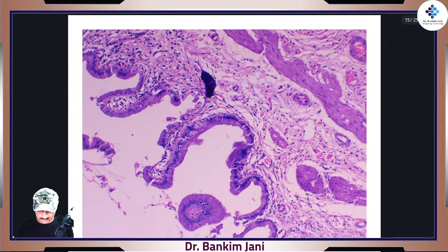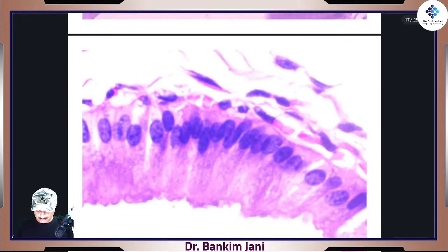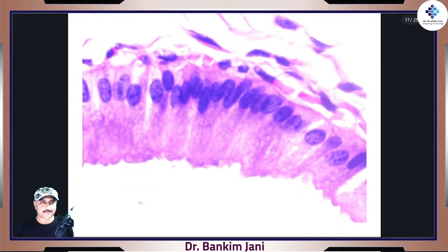Going still higher, right? Now your vision is trained, and I think most of you must have picked up this area, that yes, this is the area where all those smart, beautiful, elongated nuclei are coming up. And yes, you are 100% right.